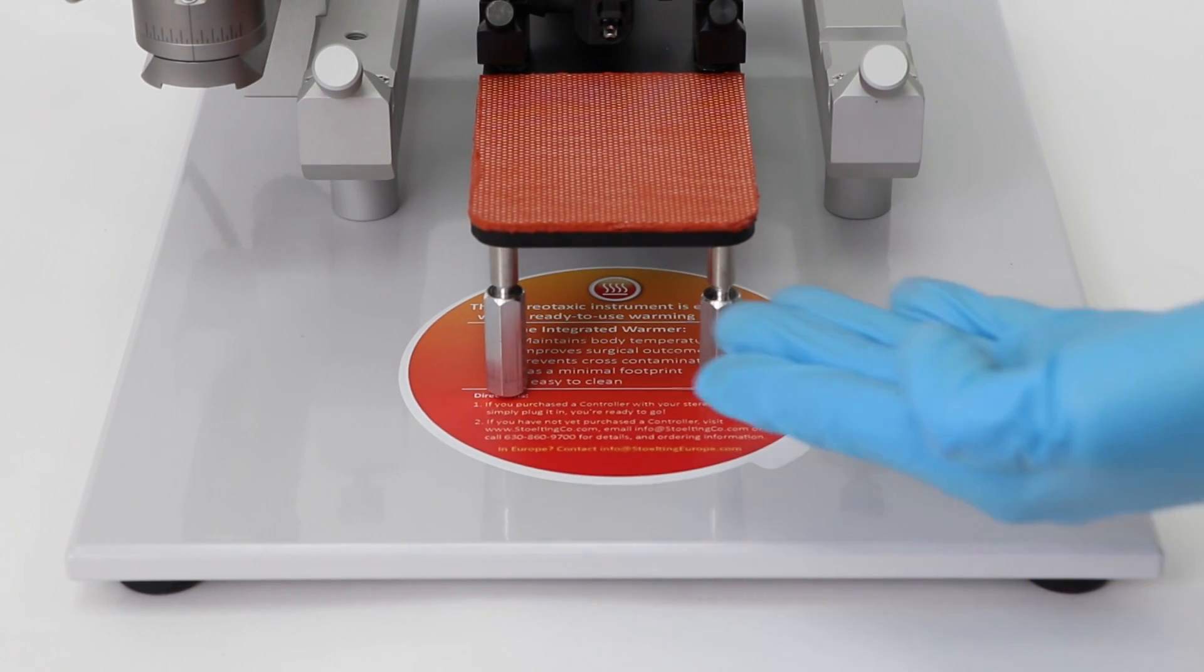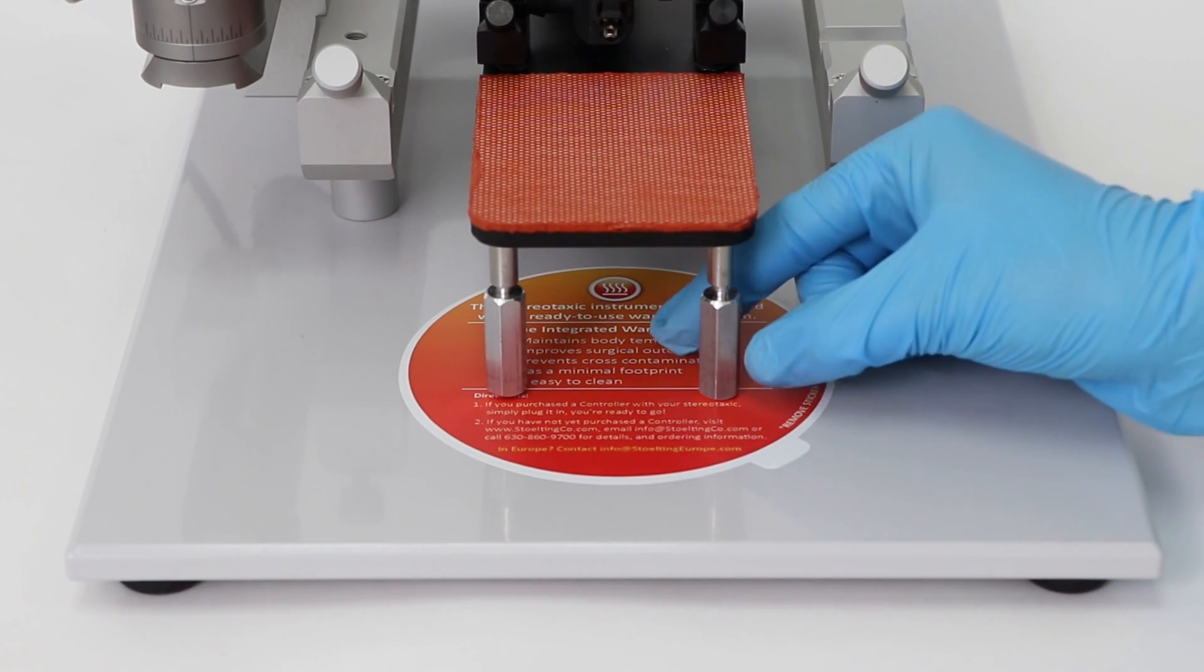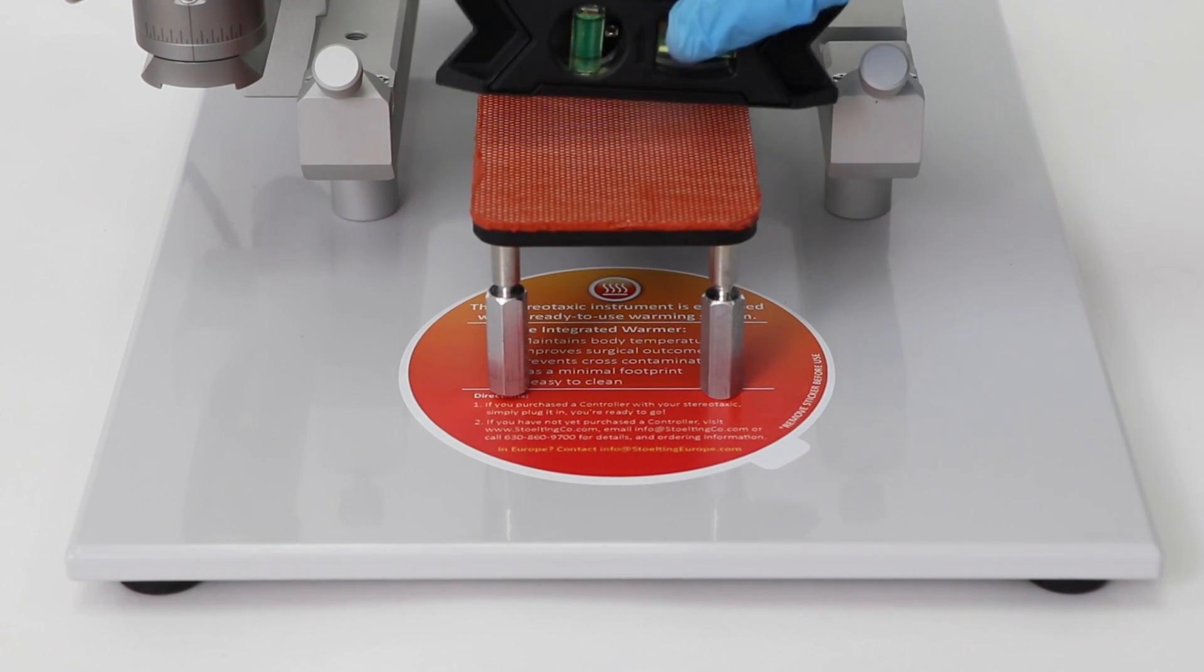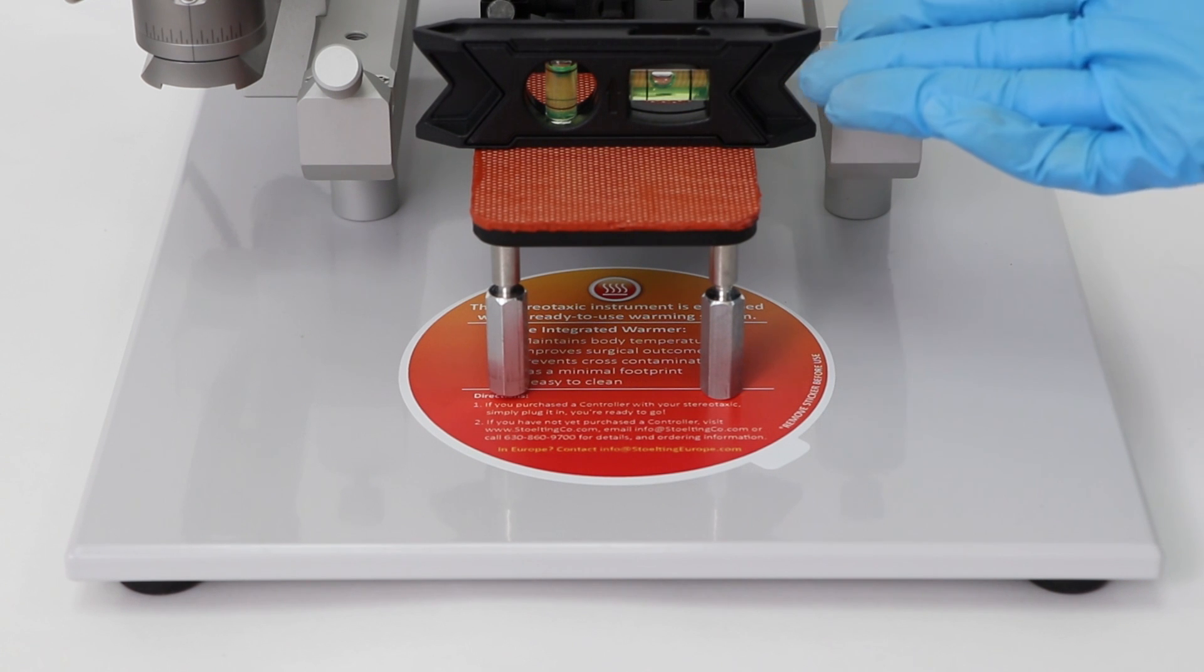Be sure to adjust the warming plate footing to be in contact with the stereotaxic base. To do so, turn the pegs counterclockwise. Make sure the base is level once you complete this step.